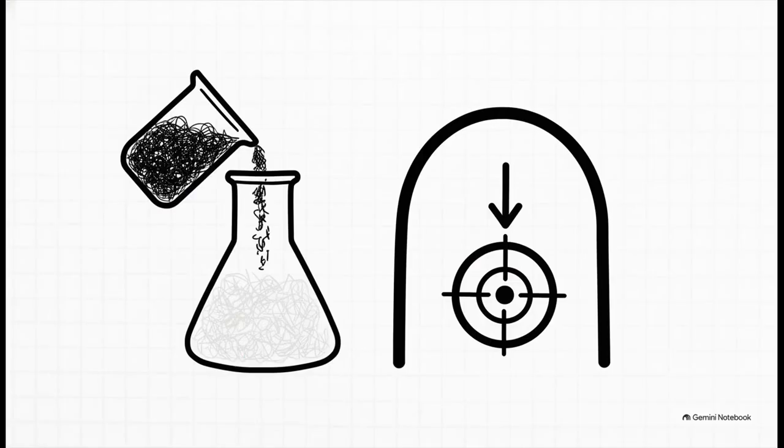But units aren't the only mathematical hurdle here. As a data detective, you really have to look for hidden clues, and one of the absolute biggest is dilution. See, ICP instruments measure elements by comparing them to a calibration curve. But if your sample is too concentrated and falls way outside that curve, the lab has to dilute it to read it properly. The trick is, did the lab mathematically correct the final number back to the original concentration? Sometimes miscommunication happens, or redilution artifacts completely mask the original concentration. So always ask, is this reported number for the original sample or the diluted one?